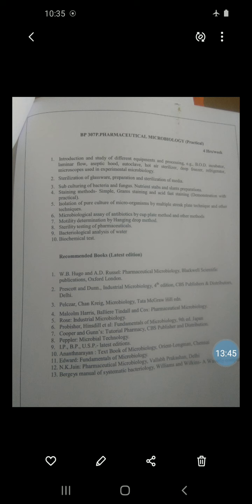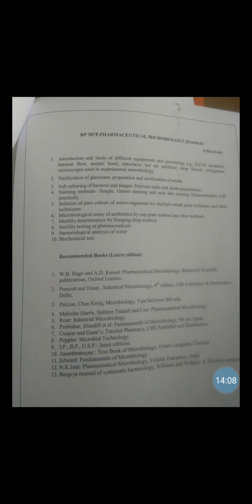The procedure: First, take a clean grease-free slide. Next, prepare a bacterial smear of each microorganism — E. coli, Bacillus cereus, and Staphylococcus aureus. Fix the smear by heat fixation. Place the slide on the staining tray and flood the smear with crystal violet — the primary stain. Allow the staining solution to react with the bacterial cell for 30 to 60 seconds, then wash the smear with water. Add a few drops of Gram's iodine solution and keep it for one minute.